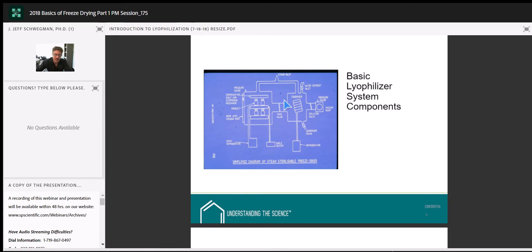You'll see samples sitting on shelves. There's a thermal fluid — generally silicone oil — that pumps through those shelves, and we control the temperature through a heat exchanger. The vacuum comes through the condenser chamber. In this particular case, this is a unit used for sterile product manufacturing — it is steam-sterilizable, as you can see the steam inlet.